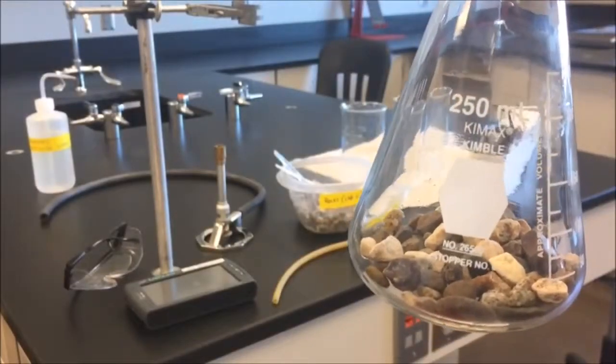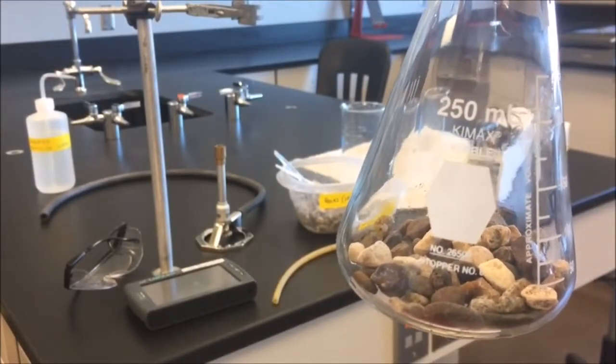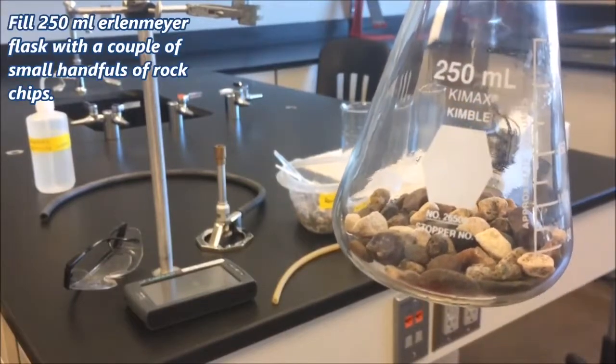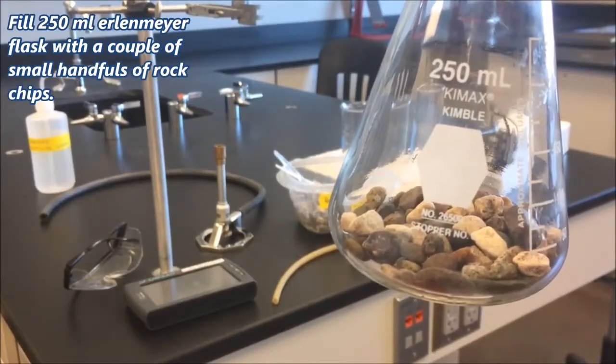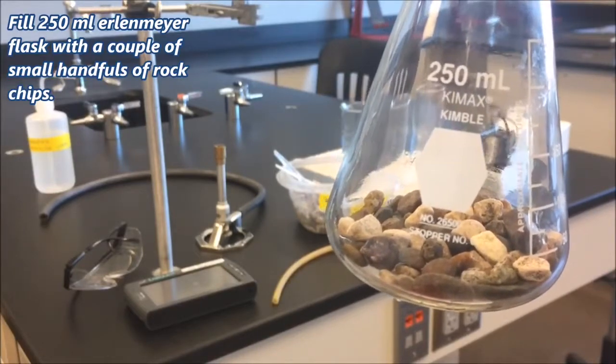So the first thing we want to do in this procedure is to fill the Erlenmeyer flask with a couple small handfuls of rock chips. This is going to prevent the flask from over boiling when we run our procedure.